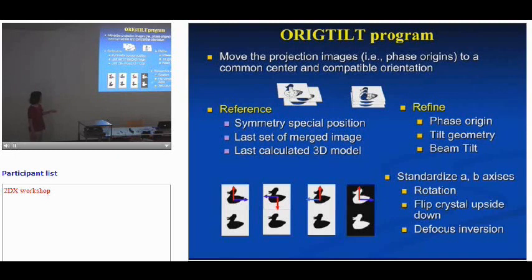So you need to consider that as well. It's possible that you may need to take the axis that you used before and flip it upside down in order to have the same structure inside your unit cells.